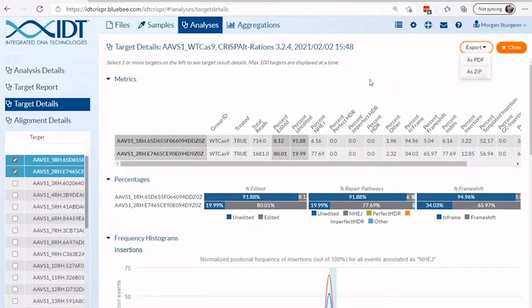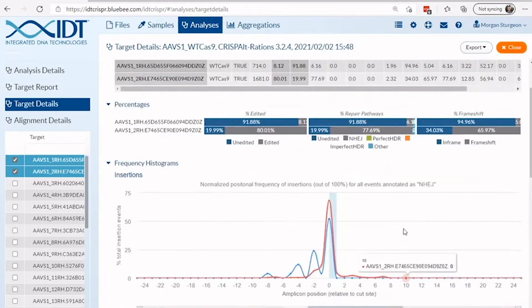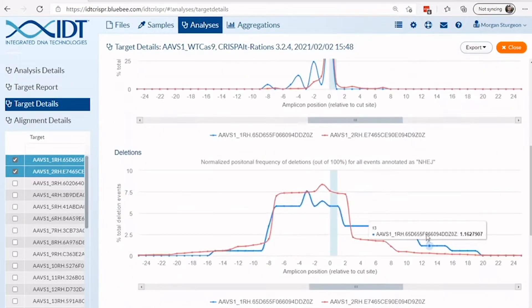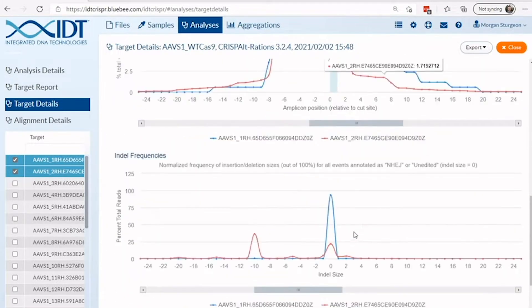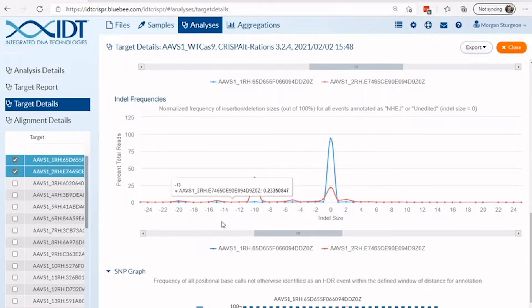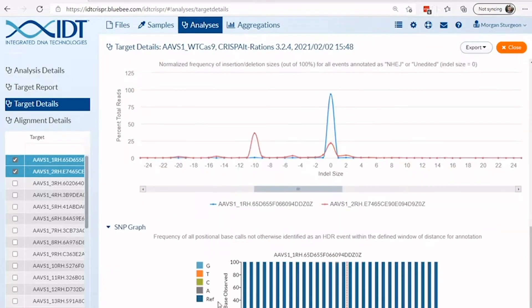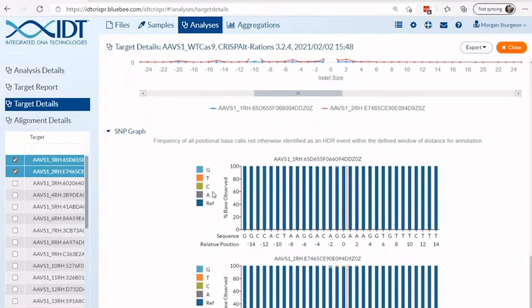From this page, you can find a range of data including the frequency of editing, repair pathways used, and frame shifting events. Additionally, you can explore the position of insertion and deletion events that occurred in the sequence sample and the size of these events. We also include a SNP graphic that shows the frequency of non-reference-based changes.